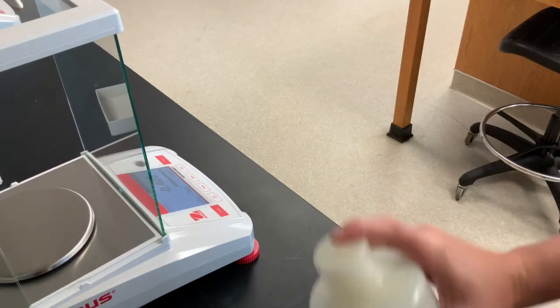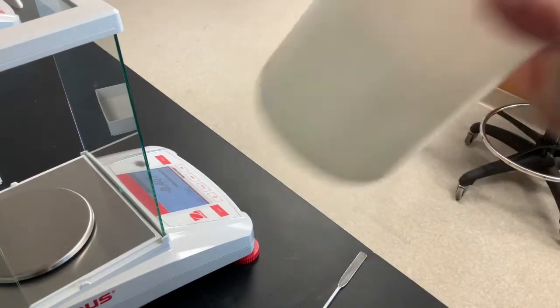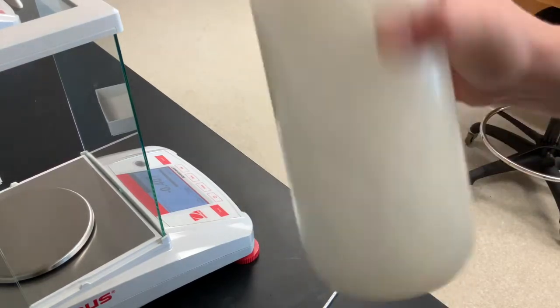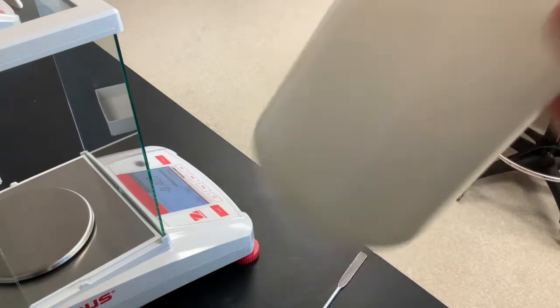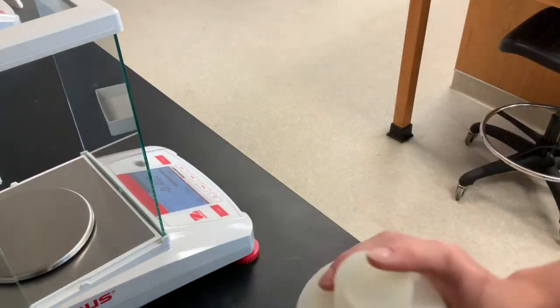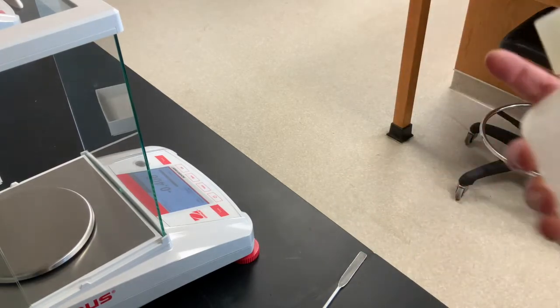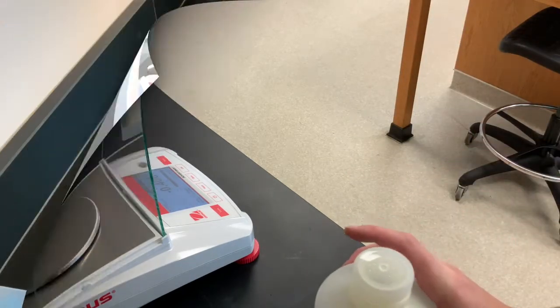And we're going to use this in order to do our experiment this week, in which we're going to figure out concentrations of other substances. So we can go ahead and stop shaking. We'll fill up the rest of this container with water, and then we'll proceed with titrating.